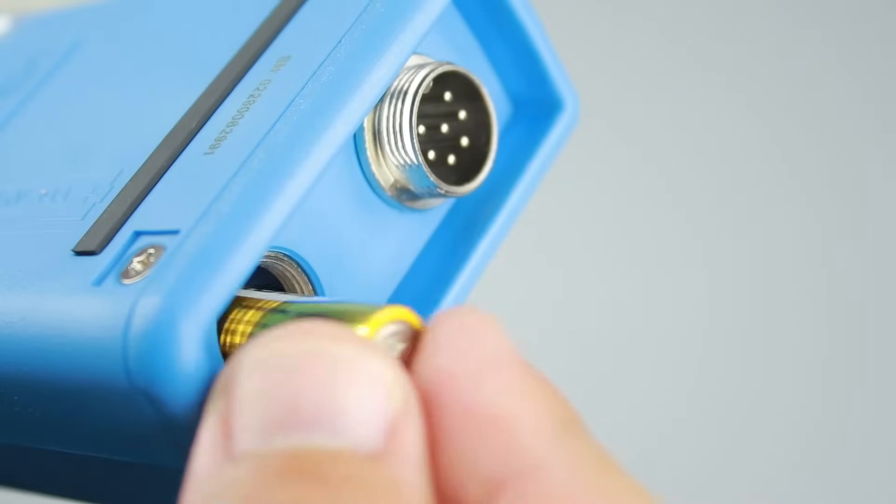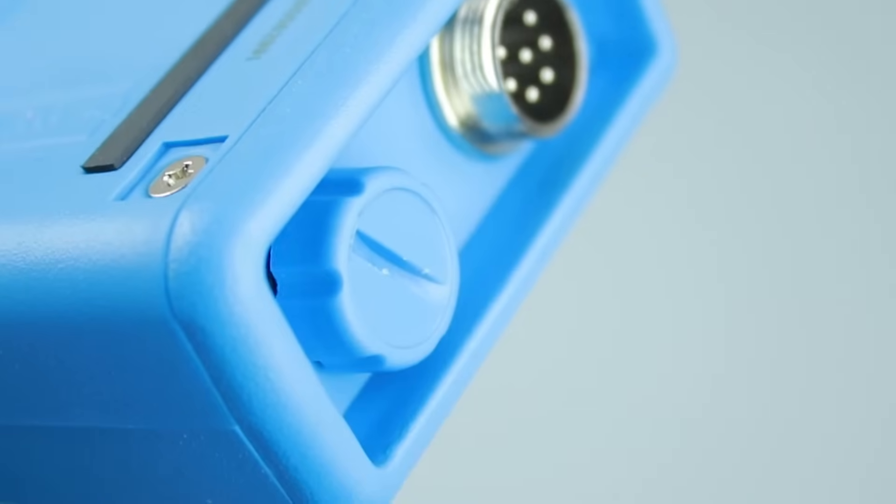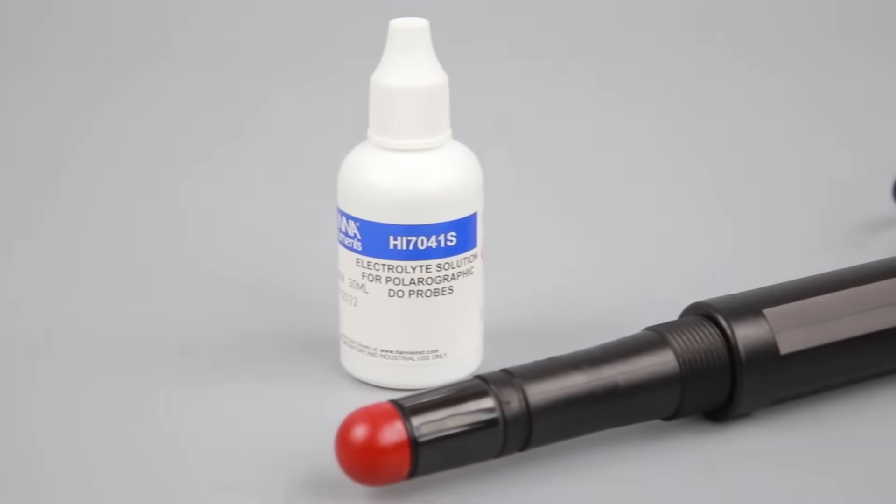To set up your meter, start by installing the batteries. Now, set up the probe. Your DO probe is shipped dry, so you need to fill it with electrolyte before you can calibrate and measure.